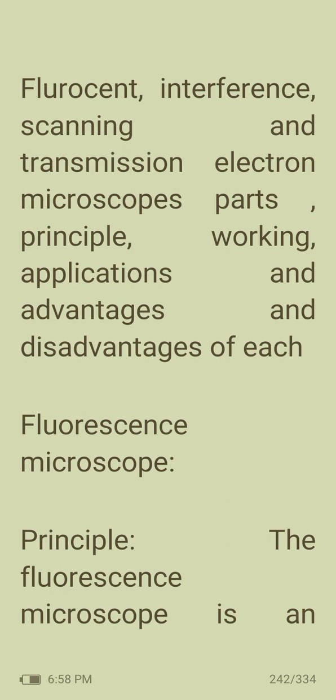Fluorescence, interference, scanning and transmission electron microscopes: parts, principle, working, applications, and advantages and disadvantages of each. First, we are going to learn about the fluorescence microscope.